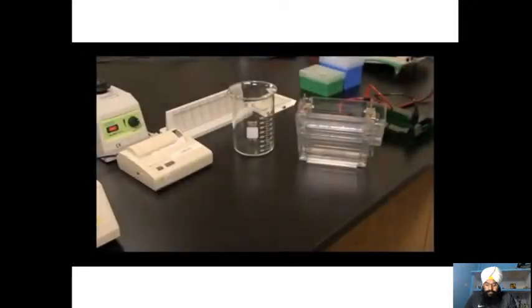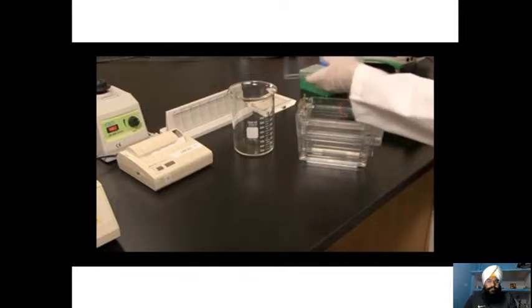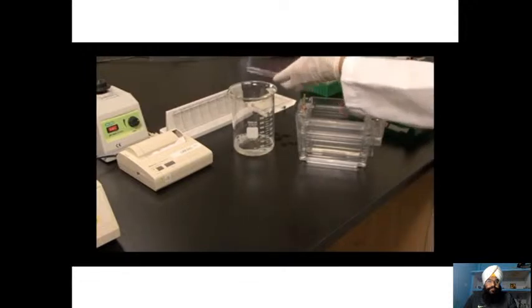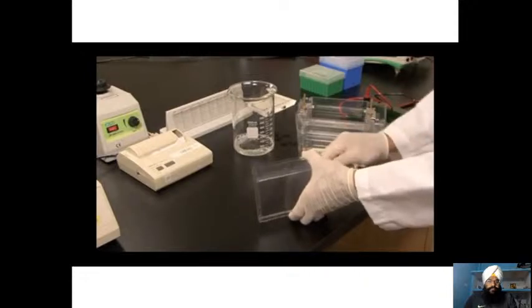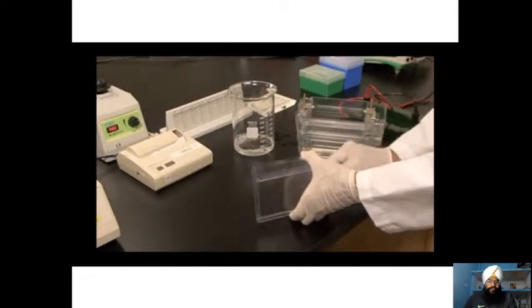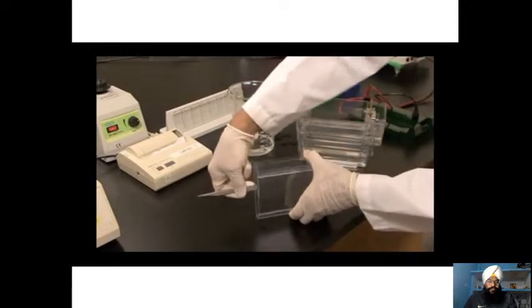The second dimension gel has now completed running. You know it is finished when the dye front has reached the bottom of the gel. We're now going to remove the gel from the Criterion cassette and prepare the gel for staining. Remove the gel from the gel box, pour out the upper buffer, and open the gel by using forceps or a similar tool, pushing the forceps against the plastic cassette towards you at the top and working your way down.